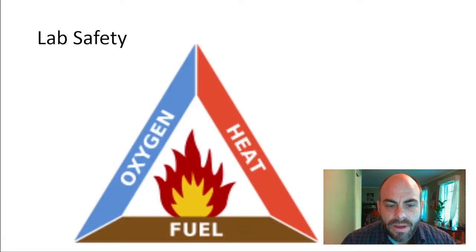Let's talk about fire. Fire needs 3 things: oxygen, heat, and fuel. If you can eliminate one of them, you can eliminate the fire. We're not going to have fire in our lab this year, so if you see one, something's wrong. And so there's gas at each table, but the gas has been turned off, and you don't have access to that. There's only one active gas thing in the classroom, and we're not going to use it, and so there's no need to have that.